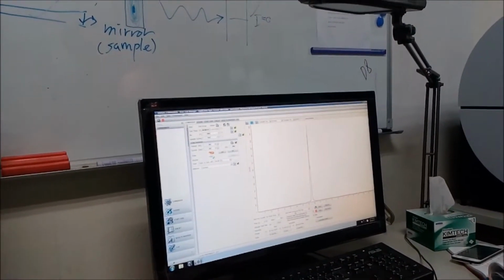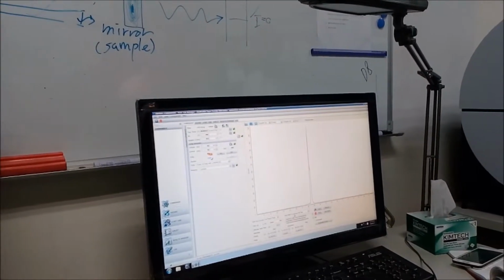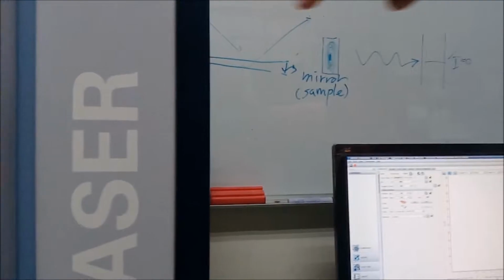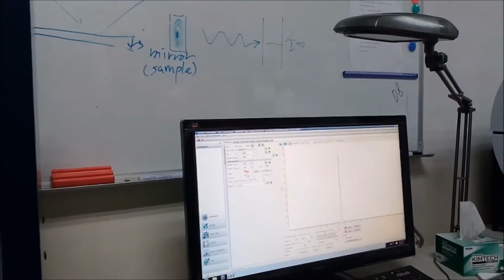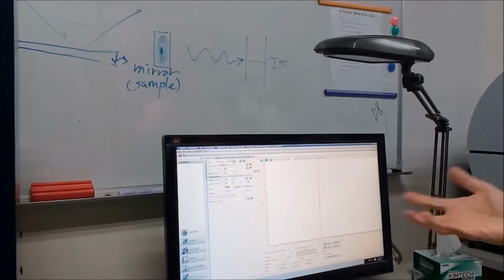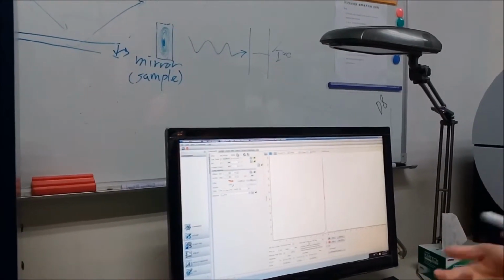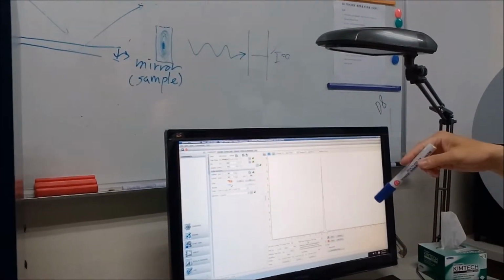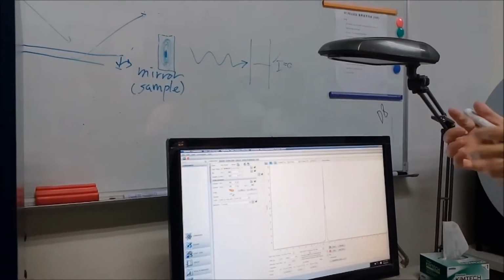In different labs, they use this differently. If I just research doping in some sample, I just do quick scans, because we just need to know they haven't broken the crystal phase.